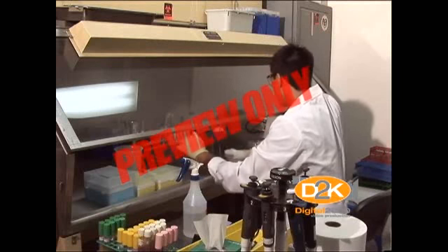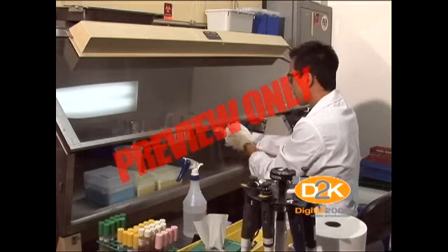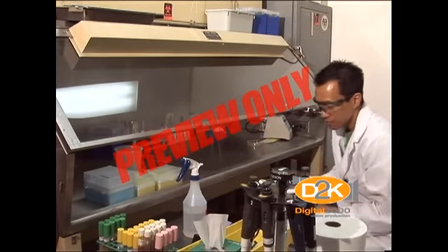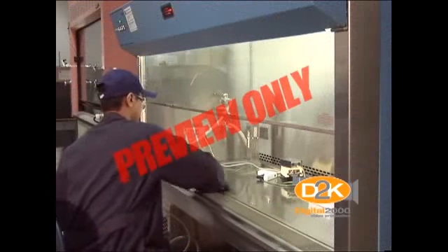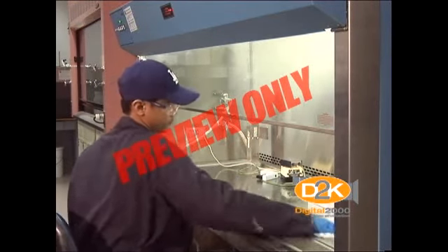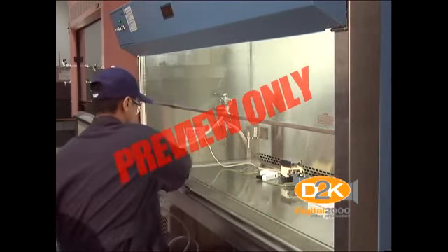Chemical disinfectants are used in the laboratory to treat a surface or an item before or after routine use, or after a spill or other contamination. Appropriate personal protective equipment must be worn when using disinfectants, and these compounds must be used in well-ventilated areas.